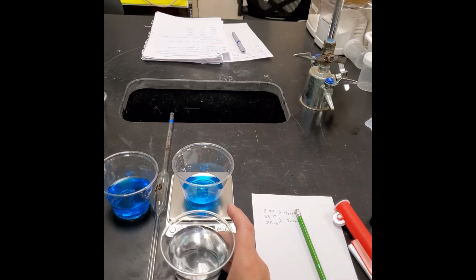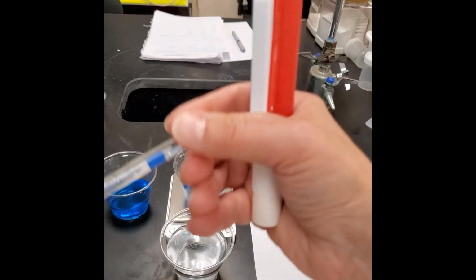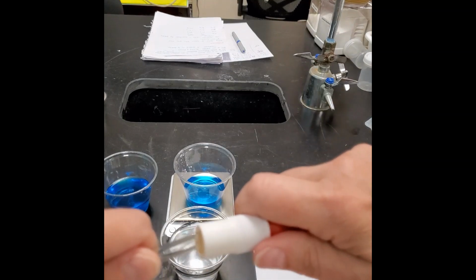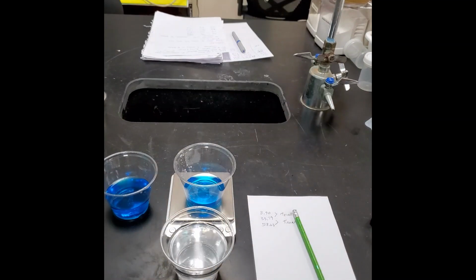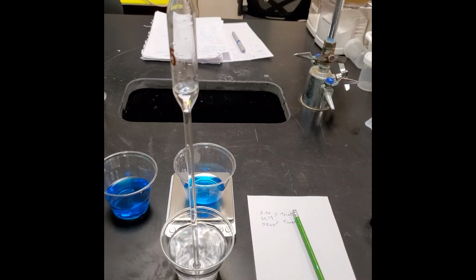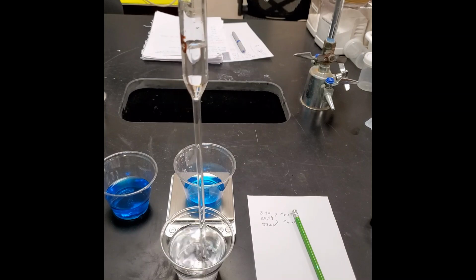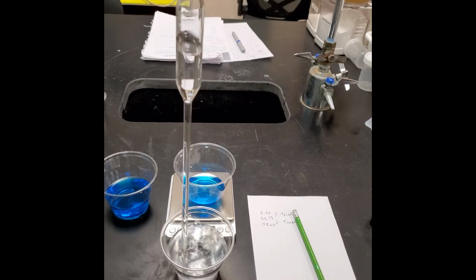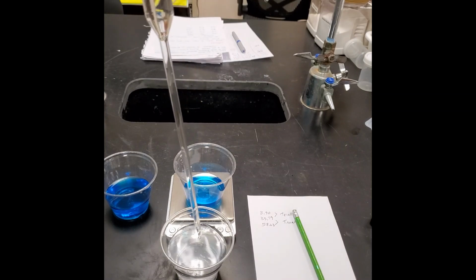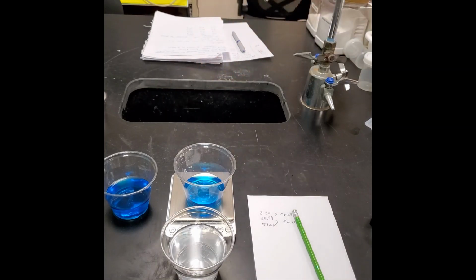Okay, you get some distilled water. You're going to take the filler, put it on the end, and you're just going to fill this up with fresh water, and you can fill it up about halfway. You're going to take the filler off, put your thumb over it, hold it over the sink, flip it the opposite way, and let the liquid drain out.